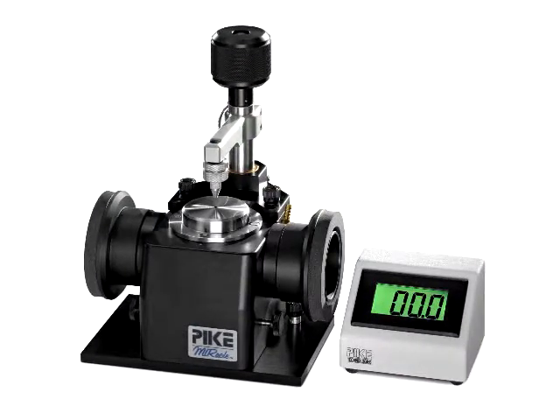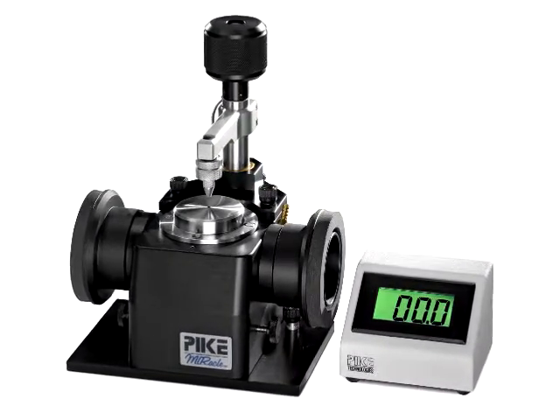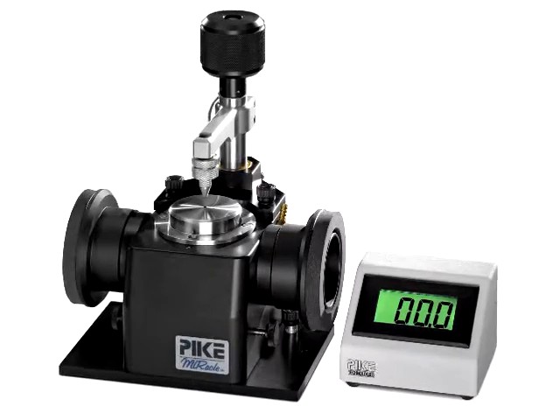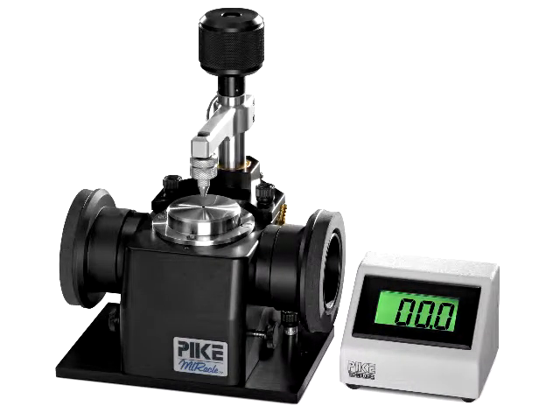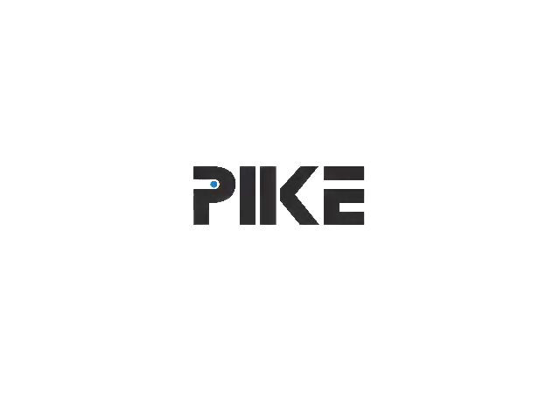Your digital force adapter installation is complete. Allow up to 24 hours stabilization time prior to use. The load assembly may require a periodic zero adjustment — refer to your user manual for detailed instructions.